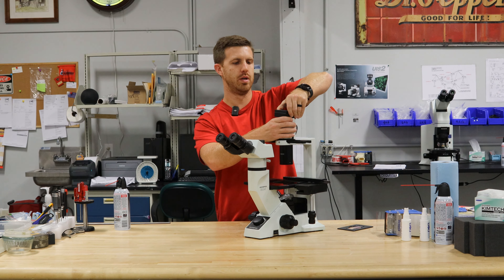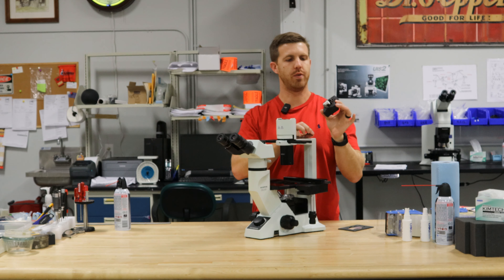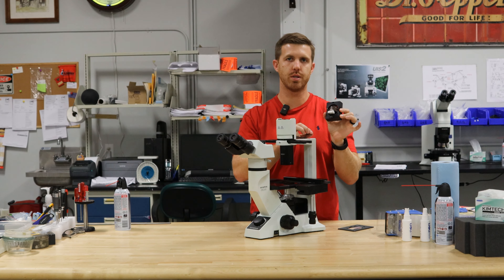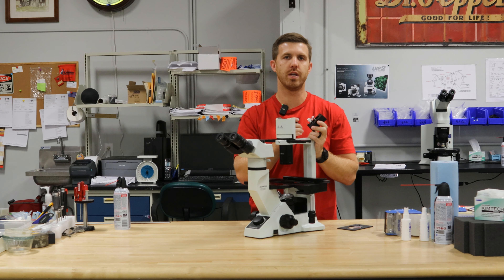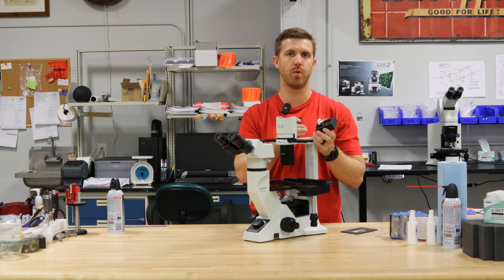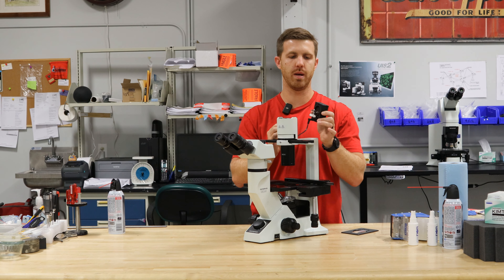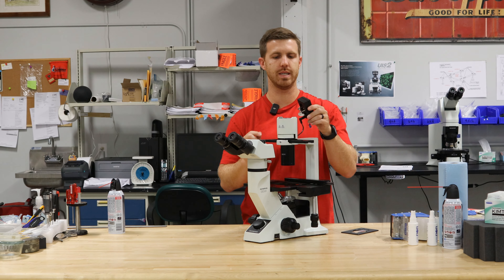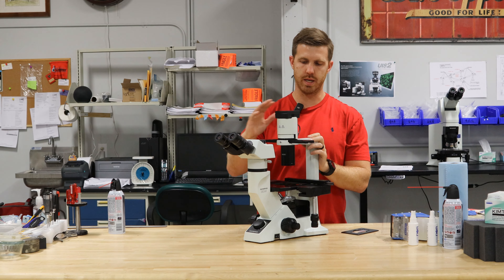We also have the lamp house. This is a 6-volt, 30-watt lamp house. If your bulb ever goes out, this is how you change the bulb — you just remove it and put a new bulb in. We have a lot of videos that'll show you how to change the bulb on a 6-volt, 30-watt lamp house. And if the lamp house goes out, it's a very inexpensive part to change, and you can replace that if you need to.